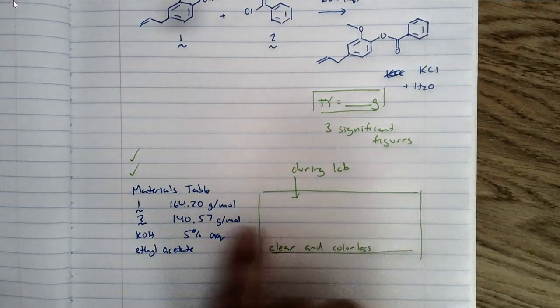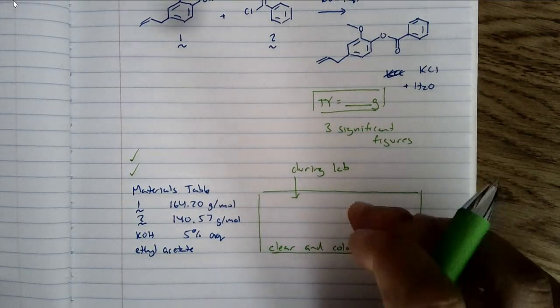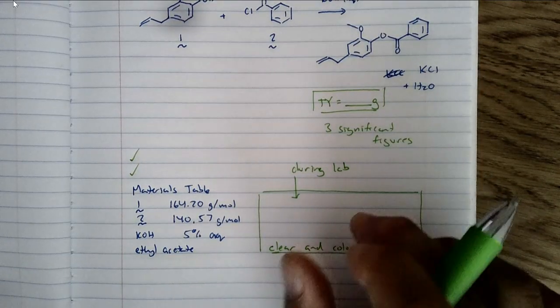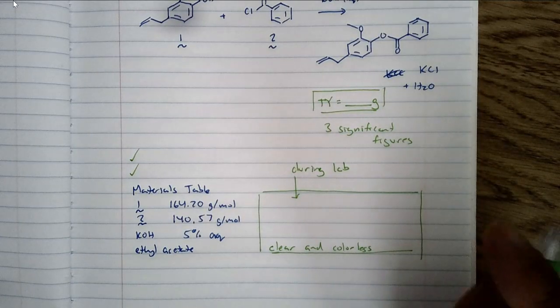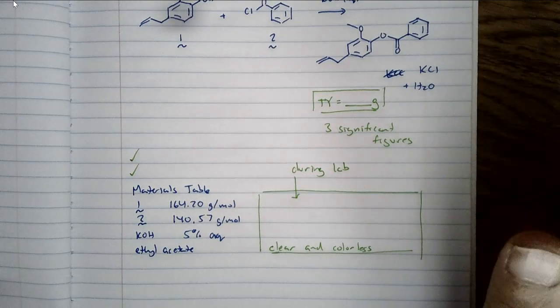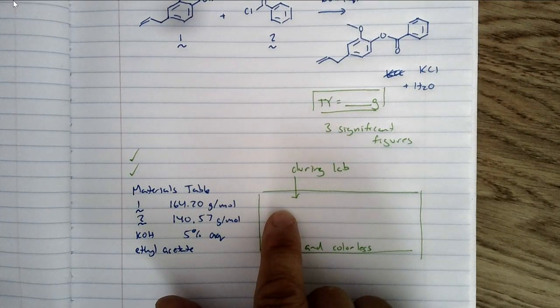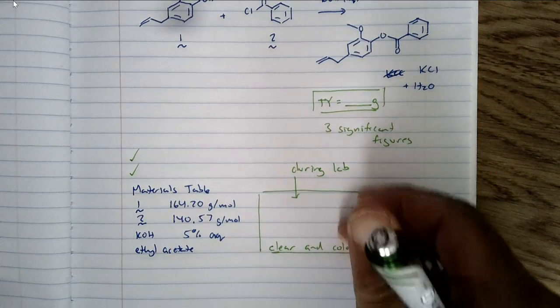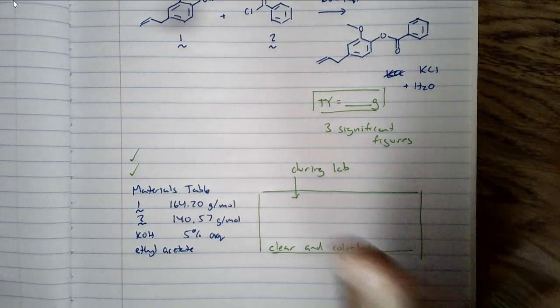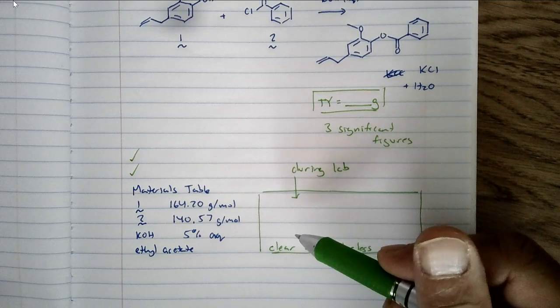Okay? Don't look it up on Google. You literally want to set your eyes on it in lab and describe exactly what you see. We do this because if there is a low yield or if the reaction doesn't work, we can always go back and say, well, this was brown and normally when we buy it it's white, so maybe it degraded. So we want a physical characterization just in case we need to backtrack and say, well, something went wrong. Could it be possible because of this discoloration?